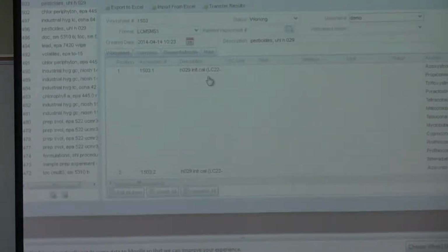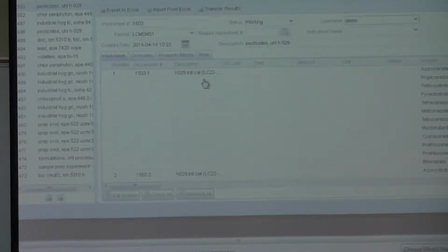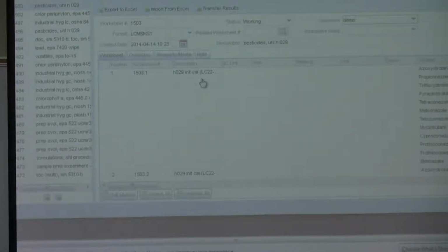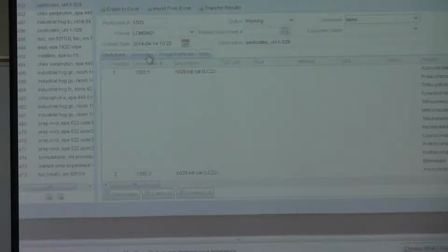Hank, any questions? Have I completely lost you? Can you make changes in the overrides if you see that you made a mistake? I will get to that. Okay, I figured. All right.